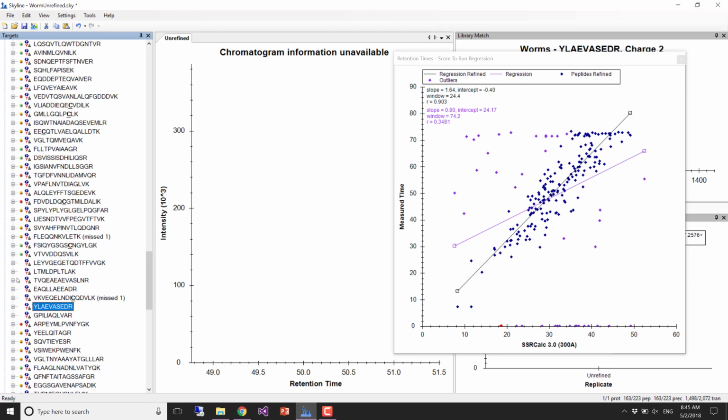It's not there. So what does the missing dot mean? There's no measurement, right? So it's not that we measured it and we didn't find a peak. It's that there was no measurement at all. Measuring it and not really finding a peak would be a red dot. So you can see that there's a whole missing swatch of peptides altogether.